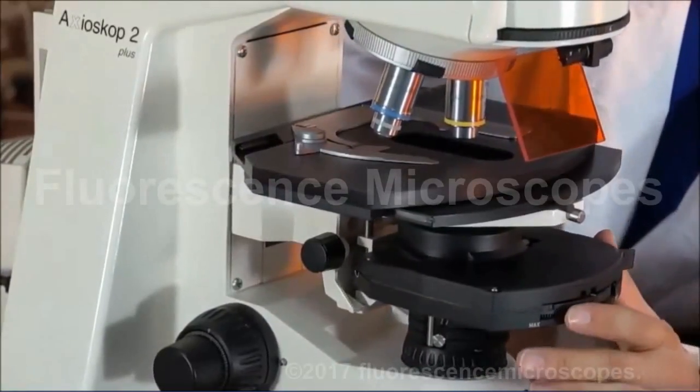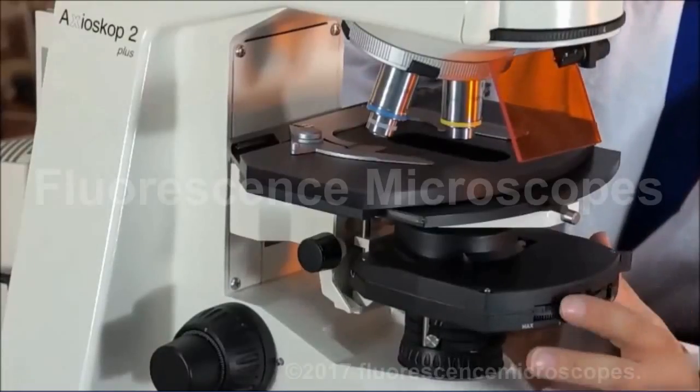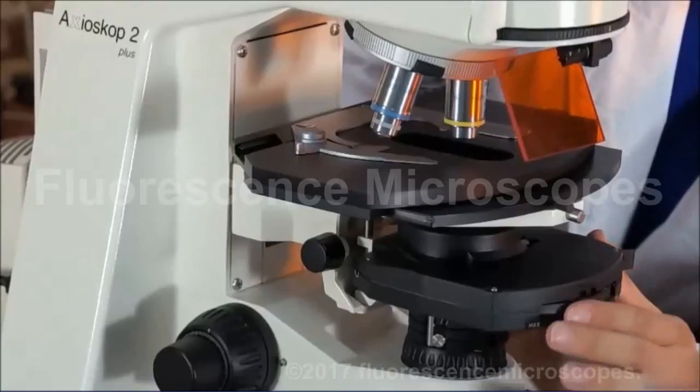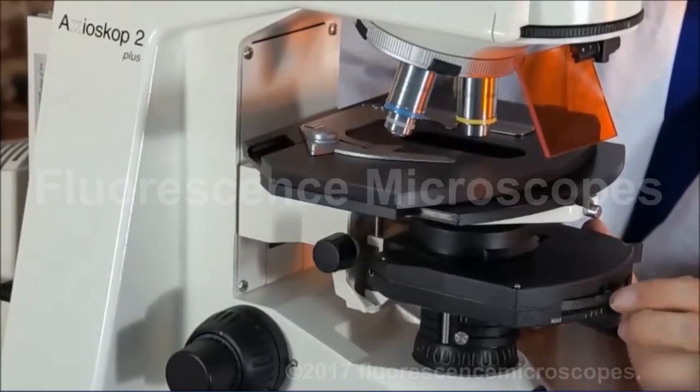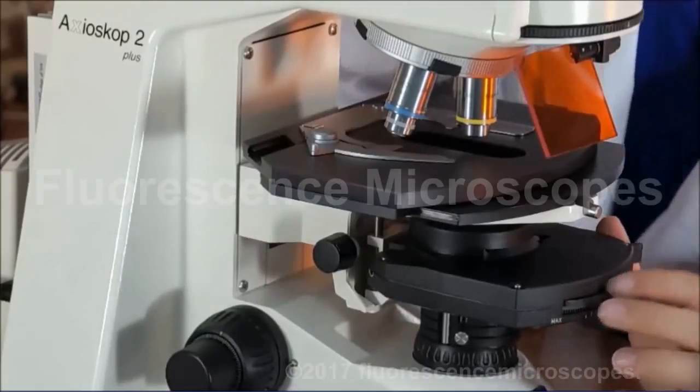And we've got a phase number 1. And we've got a dark field setting. Here's a DIC 3, Roman numeral 3. Here's a phase 3. DIC Roman numeral 2. And a phase 2. And back to your bright field.